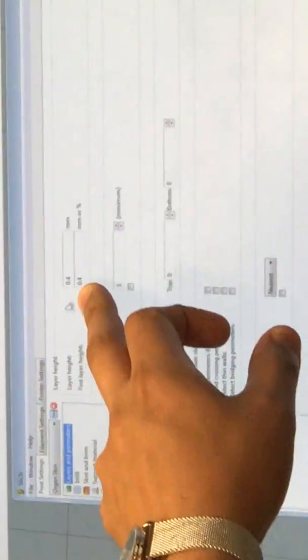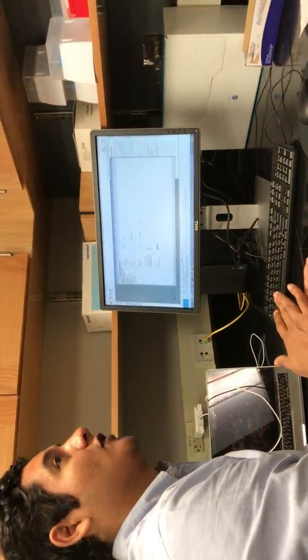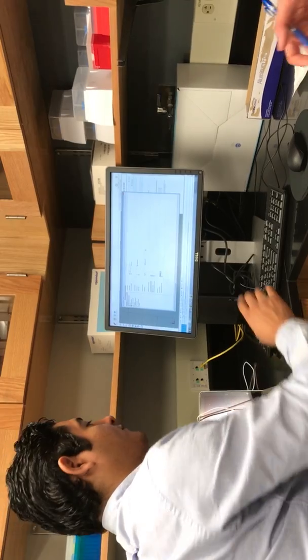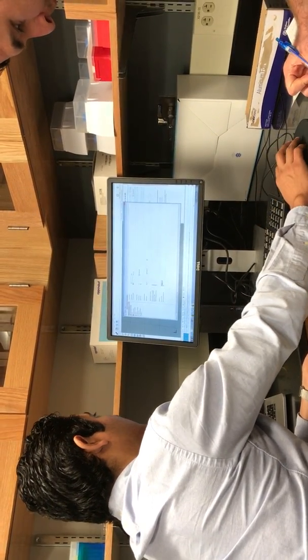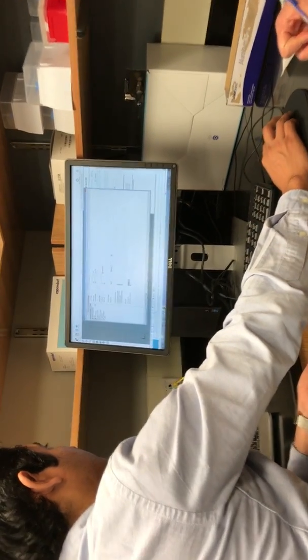So you see here the nozzle diameter is 0.3, and here my layer height is 0.4. This is a typical problem. Your layer height cannot be greater than your nozzle diameter. That's a rule, and you will get that message. That's an error.